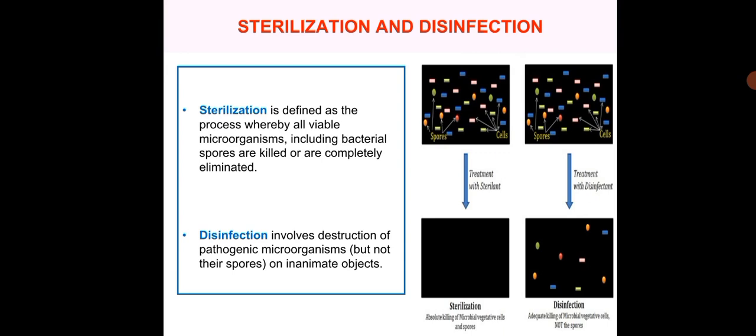Sterilization is defined as a process whereby all viable microorganisms, including bacterial spores, are killed or are completely eliminated. Disinfection involves destruction of pathogenic microorganisms but not their spores on inanimate objects.